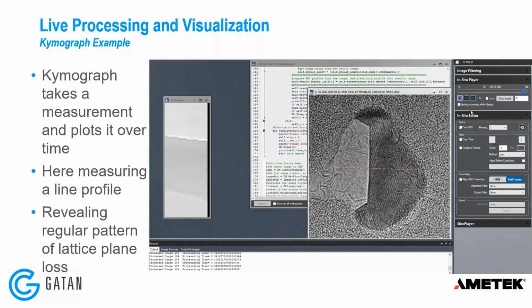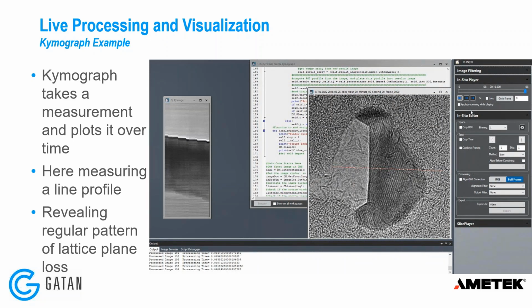But we can see here I'm getting a profile every time that the data display is updated. So whether this is data as I'm acquiring the data or as I'm playing it back, anytime that this image is updated, I'll get a new profile that's being plotted here.